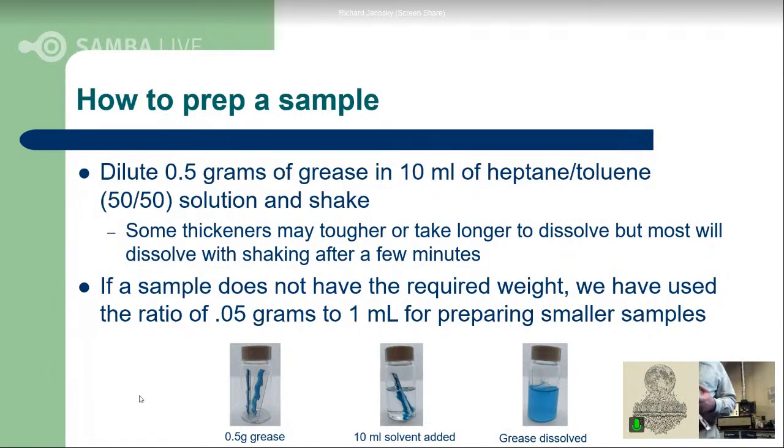And we can see Rich was holding up a sample vial and the substrate that it would come off of, and then the dissolved grease that's sitting in the vial ready to go. Yeah, Richard. So you can see kind of a darker color here, and we're starting with a darker grease. And this substrate, we've already removed a couple of these sections. You can see the remaining grease from that sample, but we dropped 2 of these in here. It might be tough to see, but if I turn it on edge there, I think you can see 2 of those substrates dropped in. Each of these substrate sections holds about 1/4 gram of grease, so it gets you to about a 1/2 gram for the purposes of this measurement.